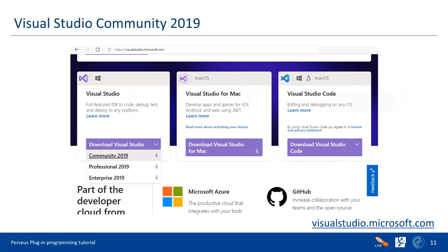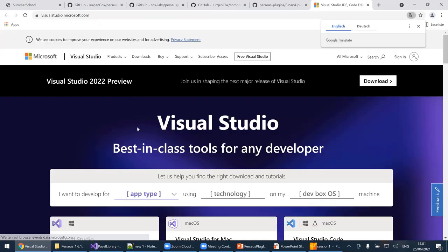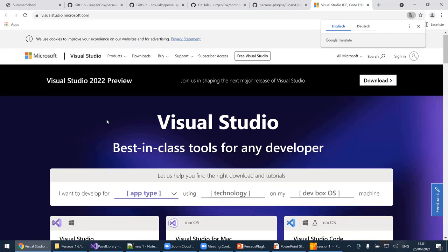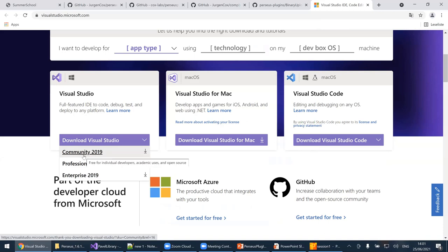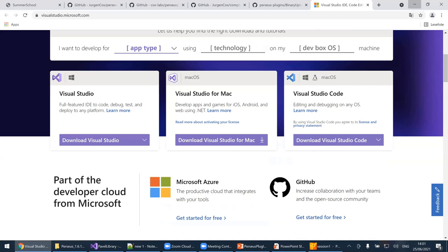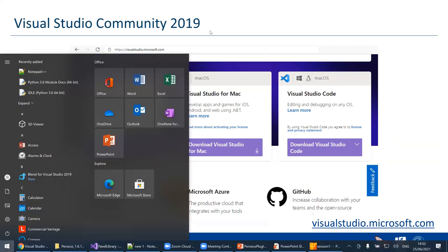Visual Studio Community 2019 is free for individuals, developers, academic users, and open source projects — exactly who we are. You can also use the professional enterprise edition if you have that license, but the Community version is free and easily downloadable. I've already done that on this computer, and we're going to use that today.